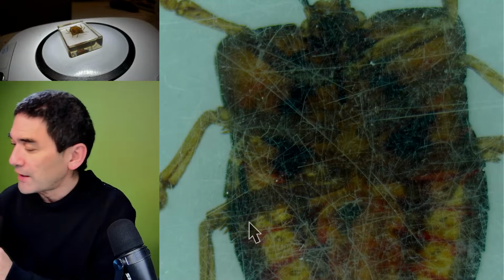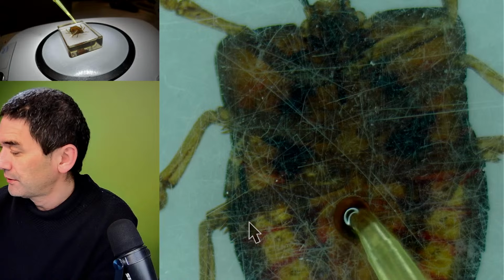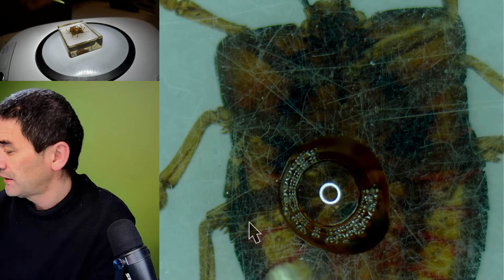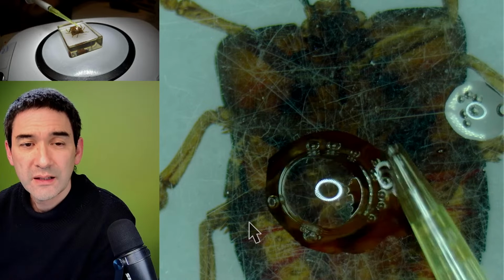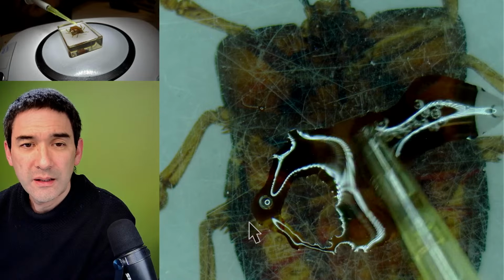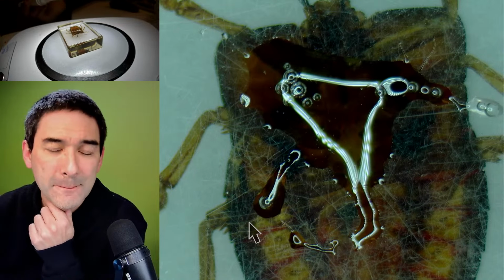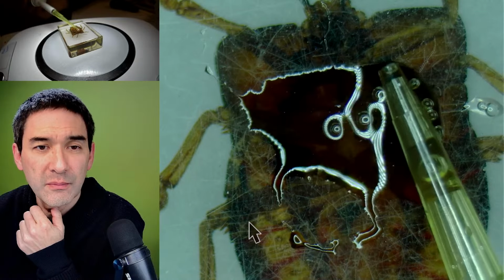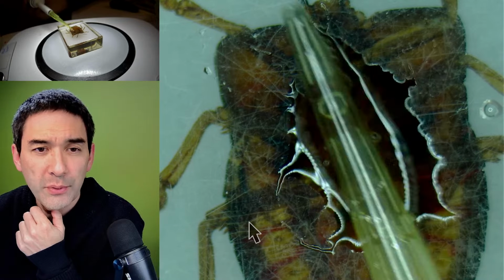Because see all of those scratches? Let's see if I'm able to make them disappear. Is this going to work or not? I don't know. Or oil maybe would also be possible. Nah, you see, it goes into drops. Okay, glycerin is hydrophilic, and it goes into a drop.